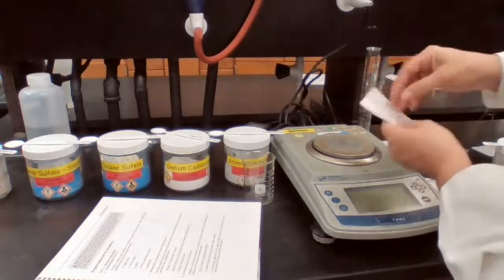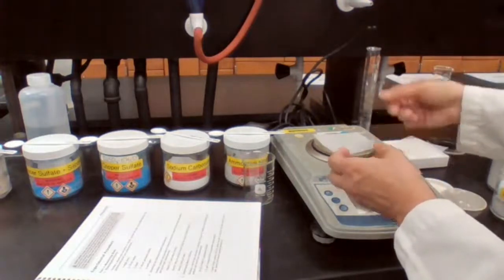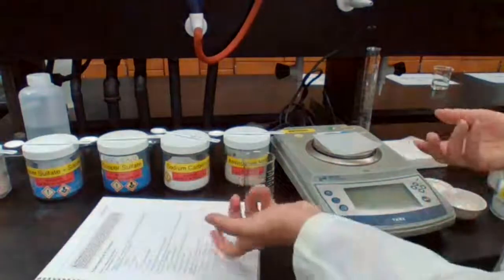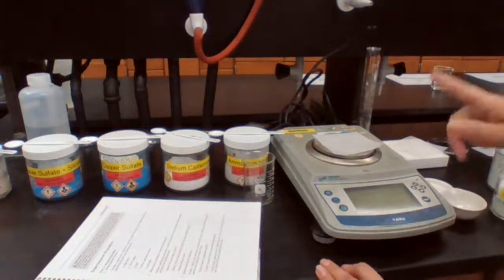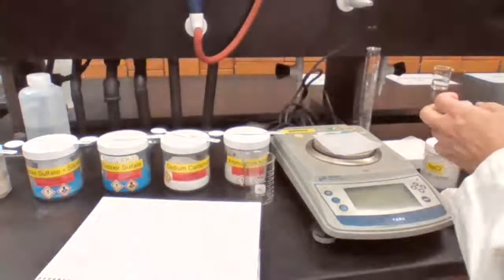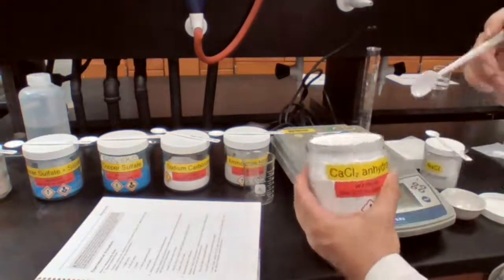The next step of the procedure is to answer the questions in the data sheet. What is the question asking you? Like coming up with a procedure. So basically you have to write in your own words how you measured this 2.75 grams using indirect measurement. Basically I placed the weighing paper on the scale, pressed the tare button to make it 0, and when it is 0, I added enough of the sample to reach the point of the measurement, which is the 2.75 grams for that first compound. And the second compound I have is anhydrous calcium chloride.